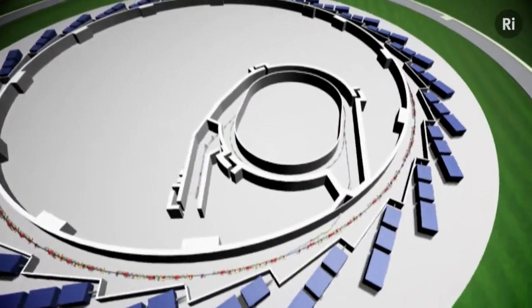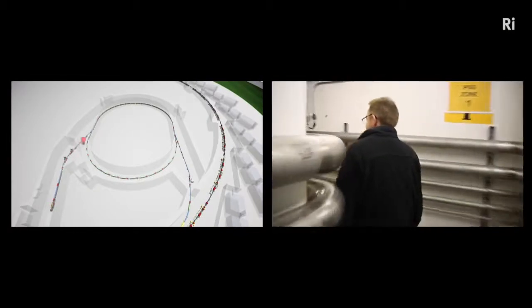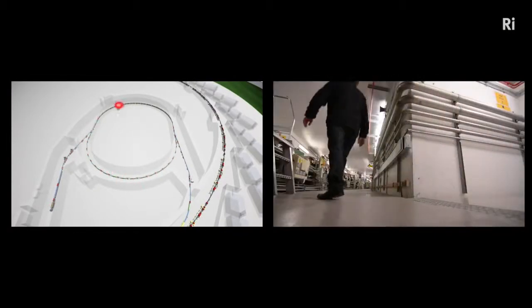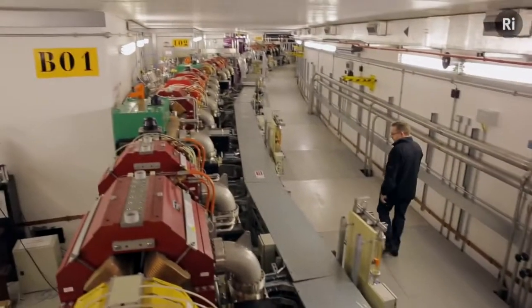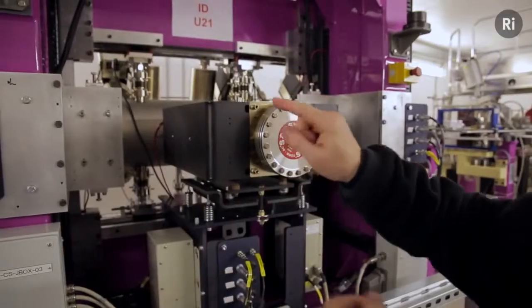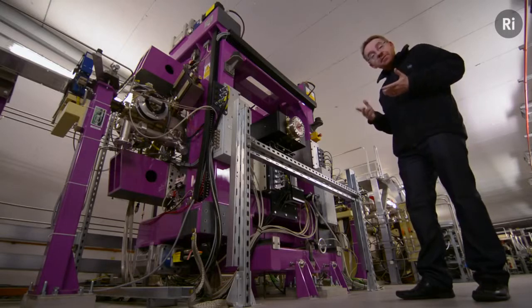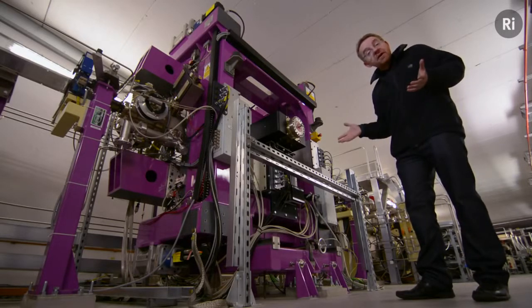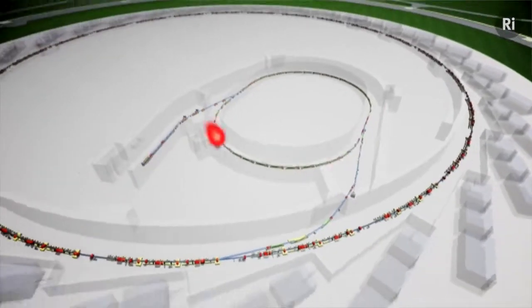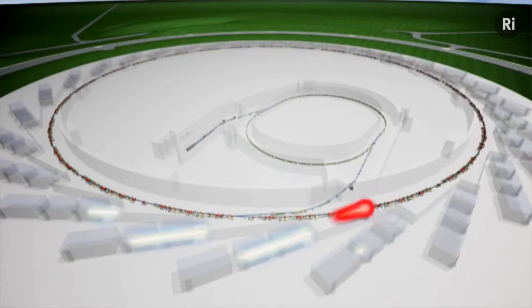Here at the core of the synchrotron is a particle accelerator ring that accelerates electrons to close to the speed of light. The ring itself is around 560 meters in circumference, and dotted around it are undulators like this one. Powerful electromagnets within this pipe force the electrons to wiggle from side to side as they pass through. And as they wiggle, they produce an intense pulse of electromagnetic radiation in the form of X-rays. And that pulse of X-rays shoots straight into one of the lead-lined experimental hutches where visiting scientists carry out their diffraction experiments.